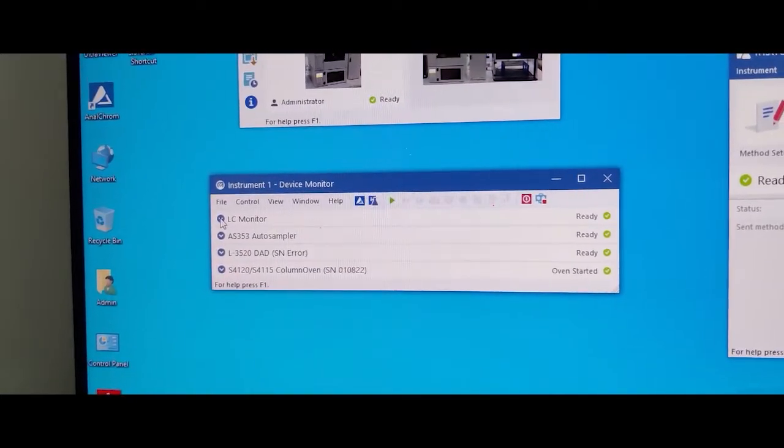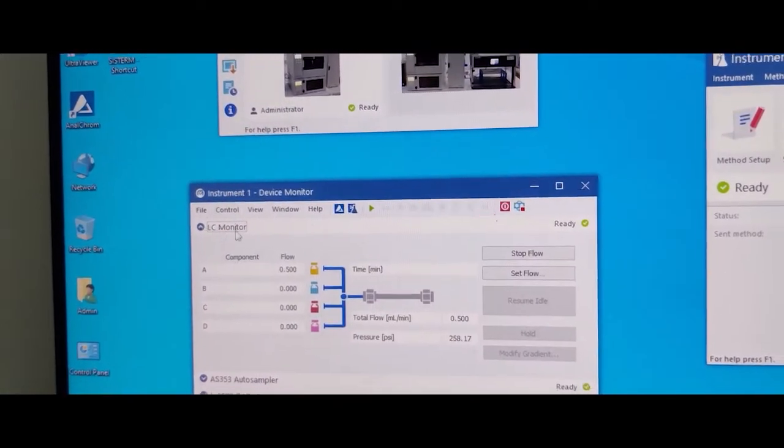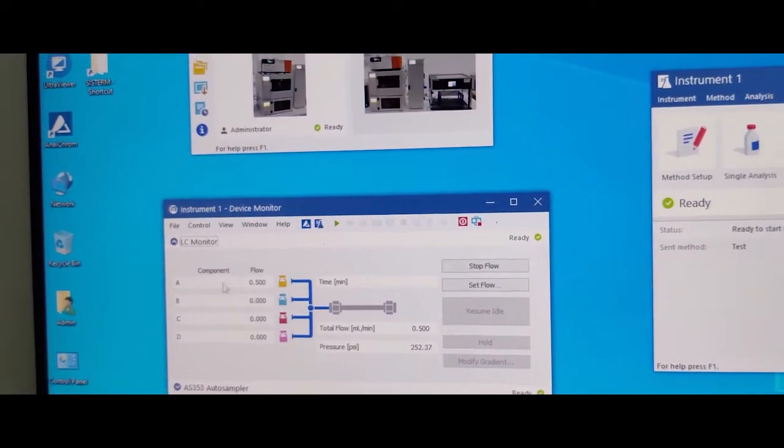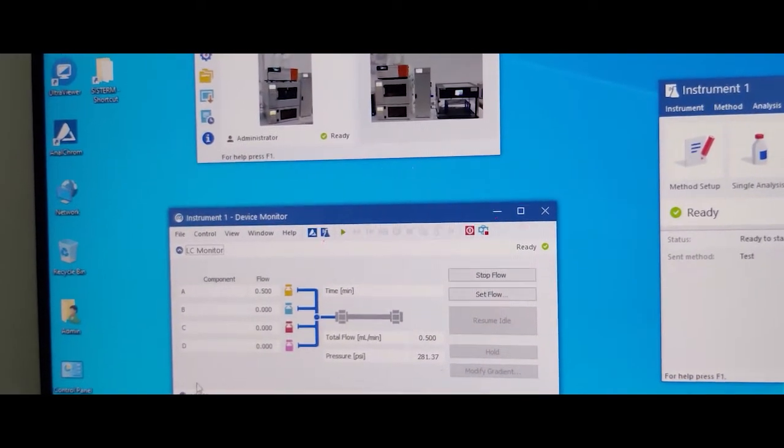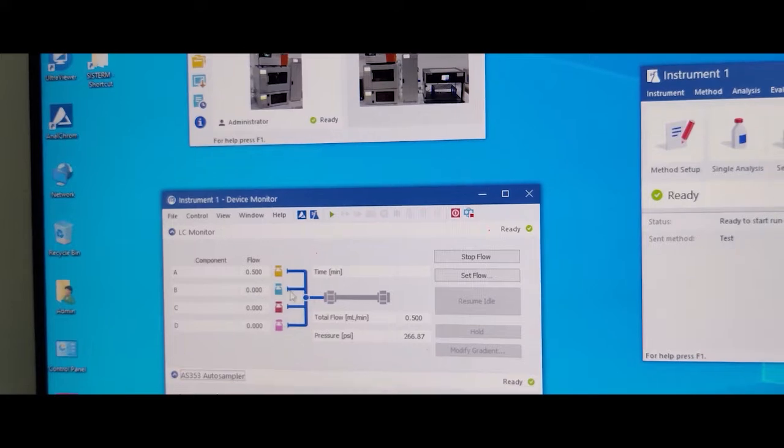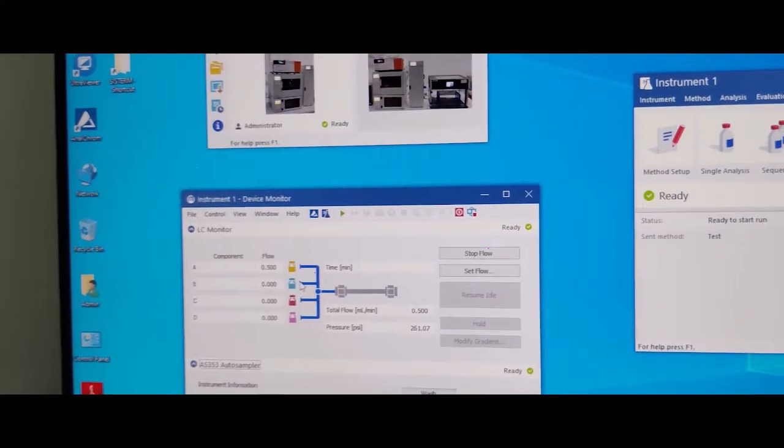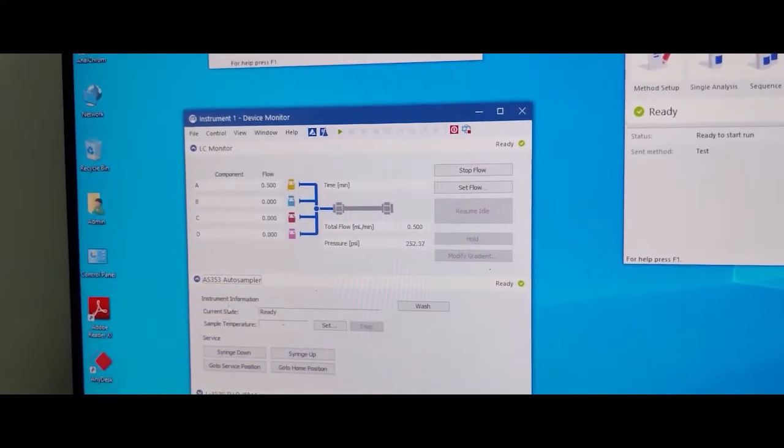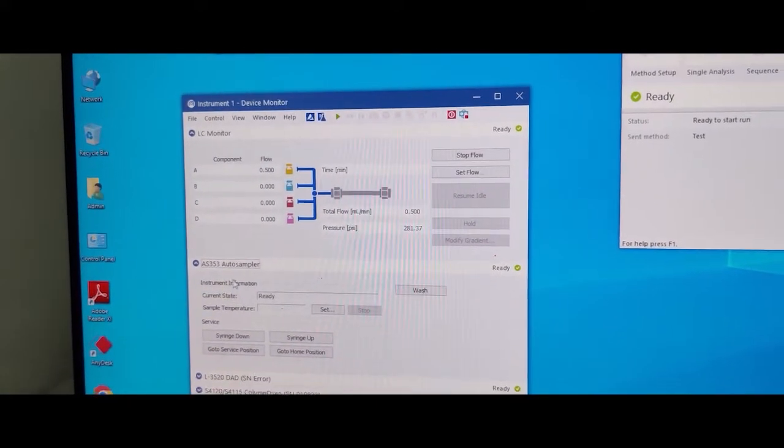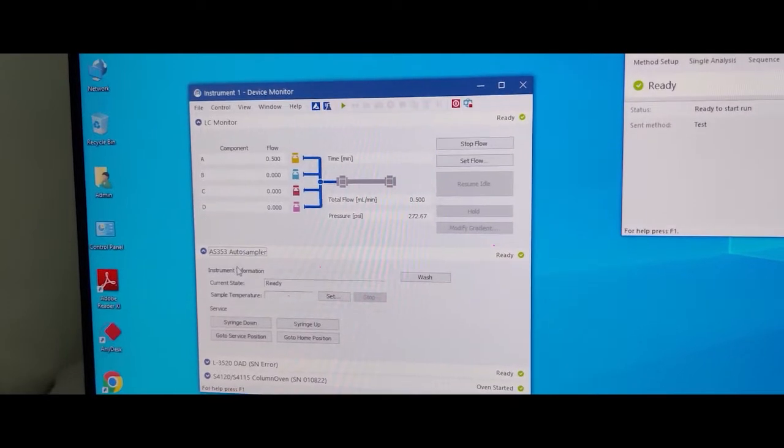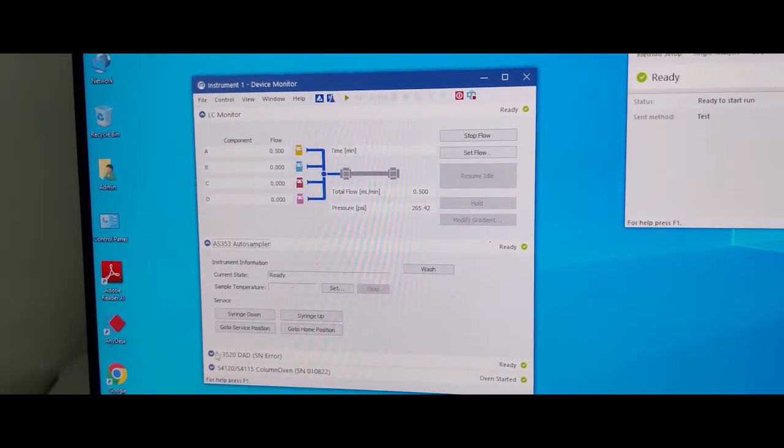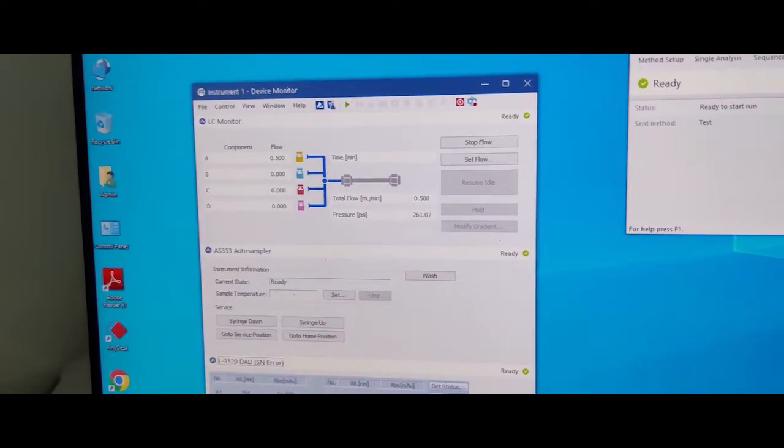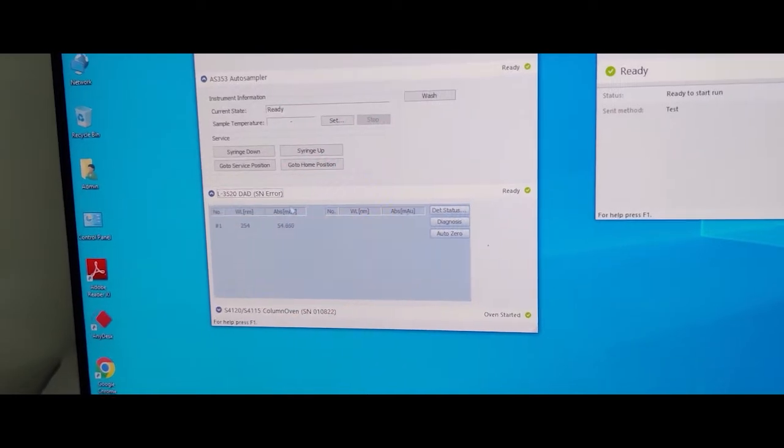Here is LC monitor, pump parameter—set the flow rate or XYZ. These are autosampler parameter, detector parameter.